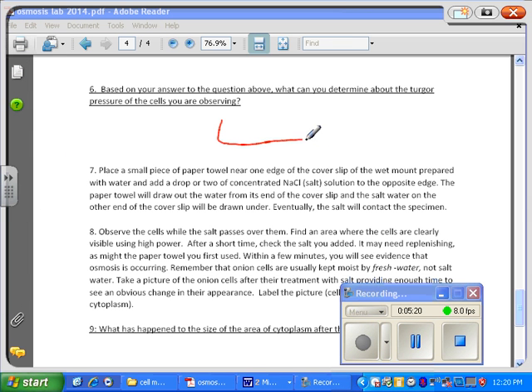was a cell that looked like this. And this is your cell wall. And so it was in a hypotonic solution because around here was just water. But in here, there's lots of dissolved stuff. So water came in. So that gives you a very high turgor pressure.